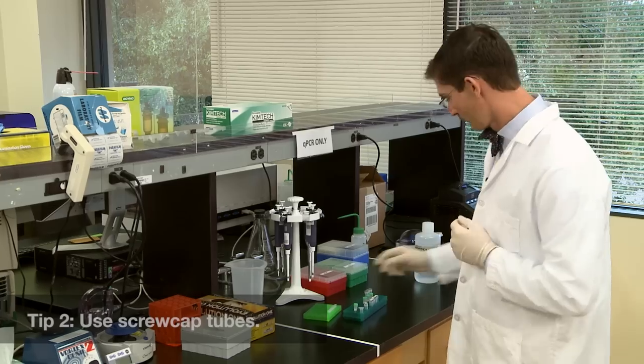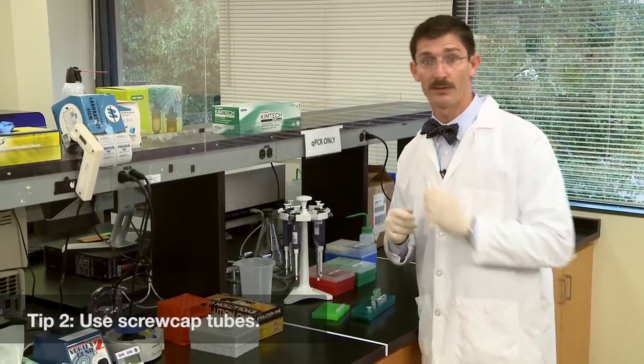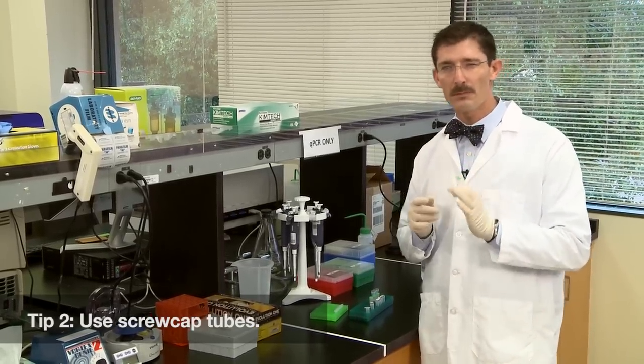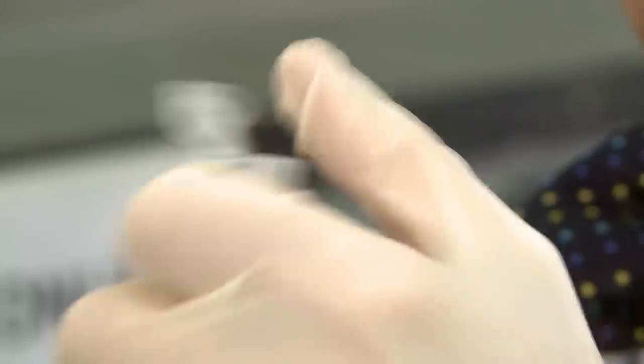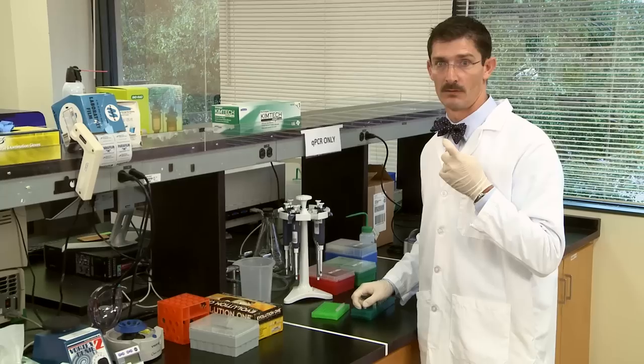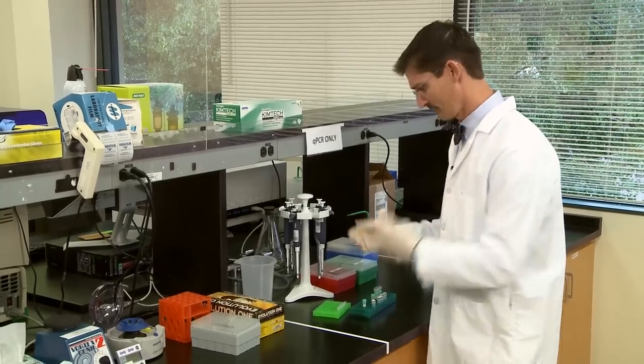Number two: whenever possible, use screw cap tubes for your template. There are few better ways to catapult your template all over your bench and your neighbor's bench than by popping open a snap cap tube. See?